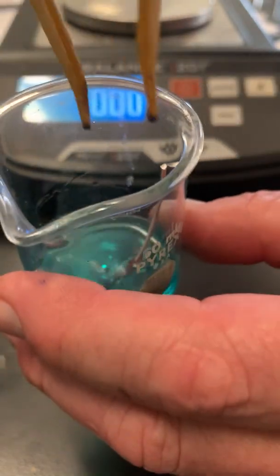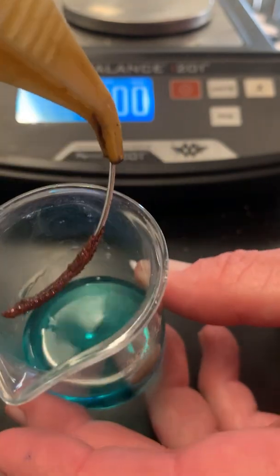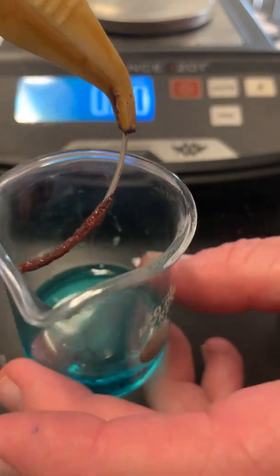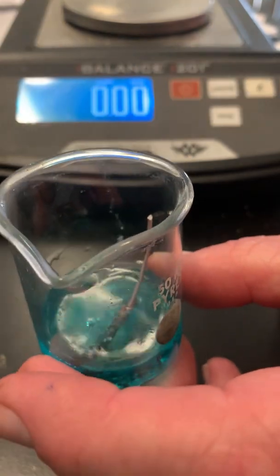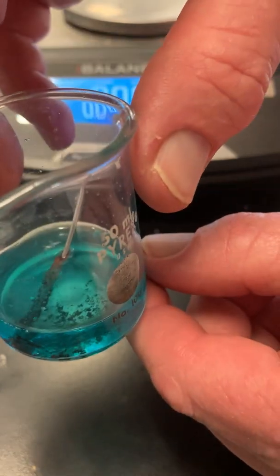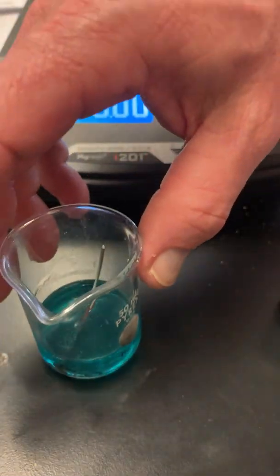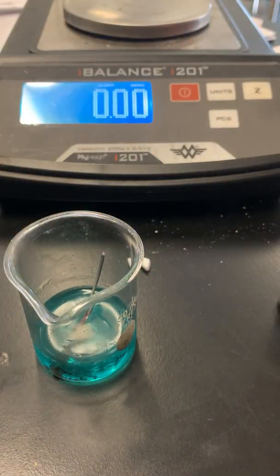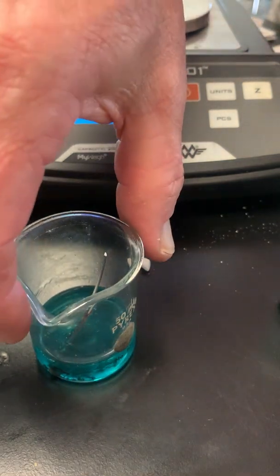And what's happening on here is you're starting to get a coating on there. And you weren't supposed to touch it because we don't want any of that coating to fall off on the bottom. And it looks like I have a little bit doing it. So you just leave this like that, and then the reaction takes place.